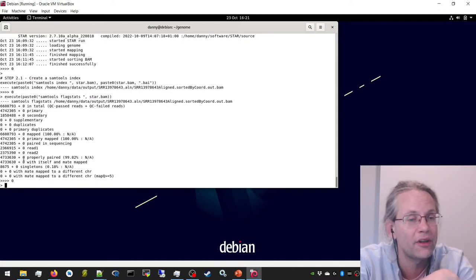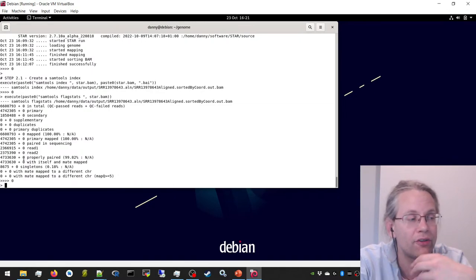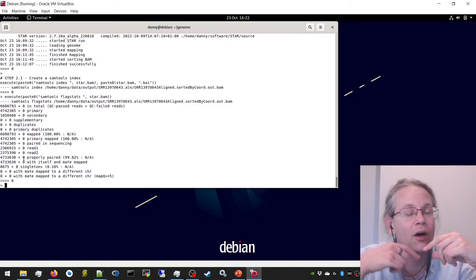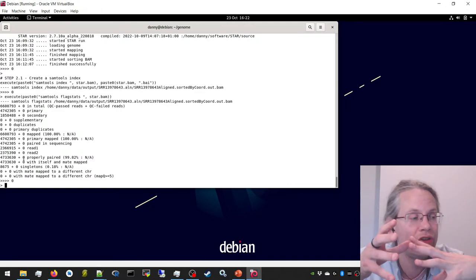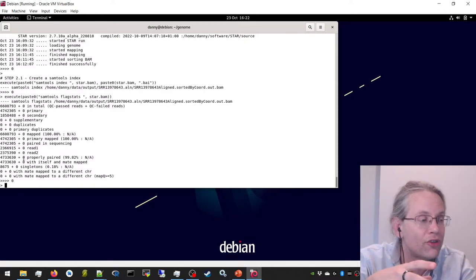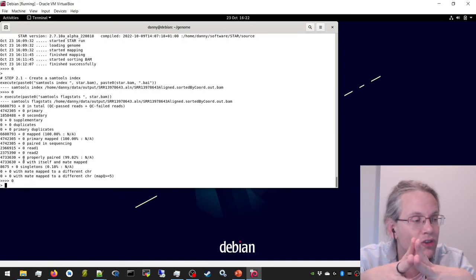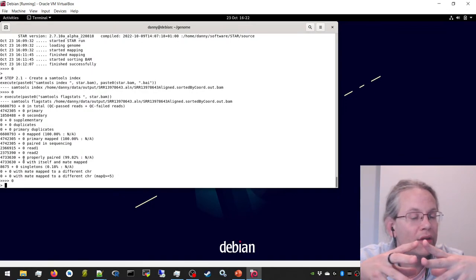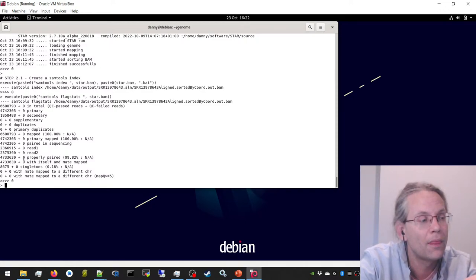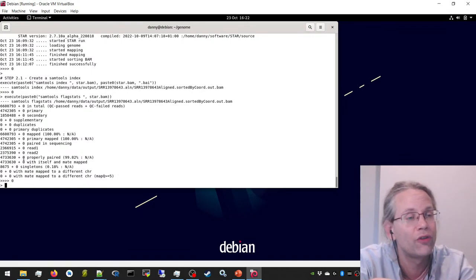So we skip that step at this point because just going through FastQC already takes a lot of time, right? It looks at the flow cell. It looks if anything went wrong with the flow cell. It looks if there are discrepancies in the ATCG in the reads. It looks to see if the adapters are still in. So yes, but FastQC is only useful before trimming. Right after trimming, you get new FASTQ files, so you can do FastQC again to see if the trimming actually solved most of the issues with your reads.